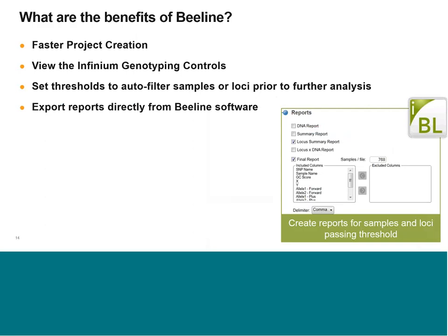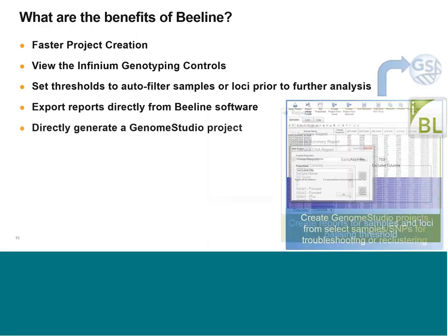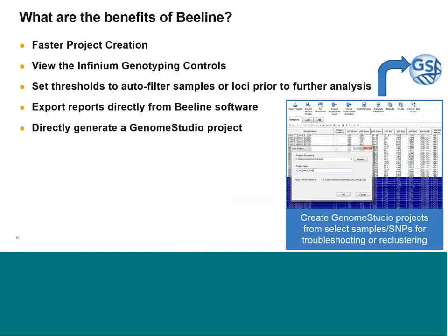Another unique feature to Beeline that Genome Studio does not have is the threshold function, which allows you to auto-filter samples or loci prior to further analysis. This bar is dynamic — you can move it up and down — and it's a nice way to visualize QC parameters and filter above and below those thresholds. The report formats generated in Beeline are the same formats used in Genome Studio. And the integration with Genome Studio means you can use both software together on the same data without generating a totally new project in Genome Studio, leveraging each software for their different strengths — Beeline for fast project generation and QC, and Genome Studio for deeper analysis and clustering.